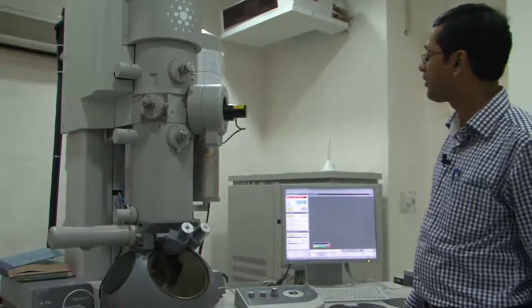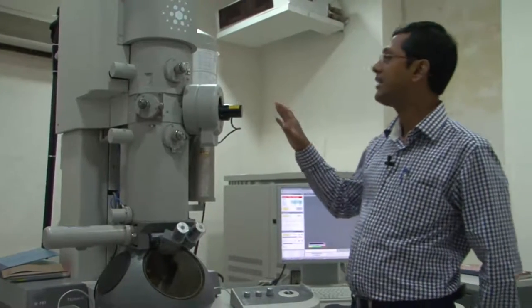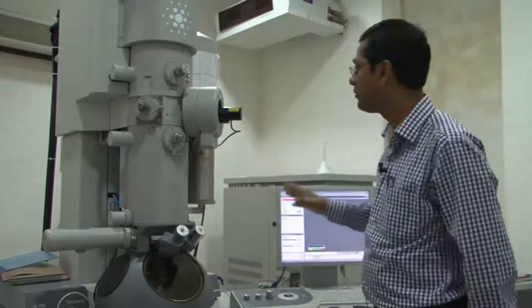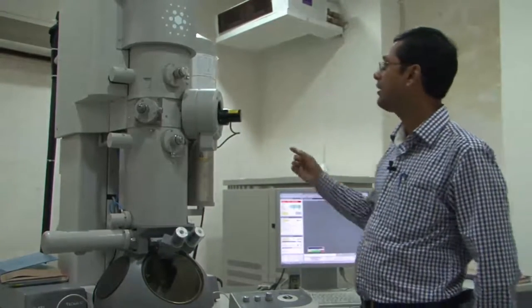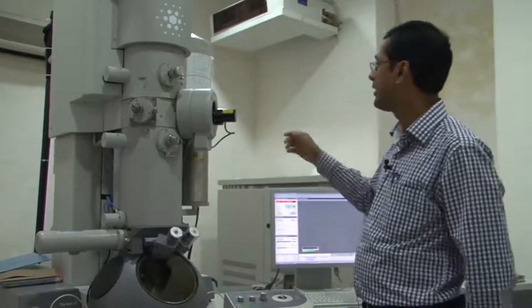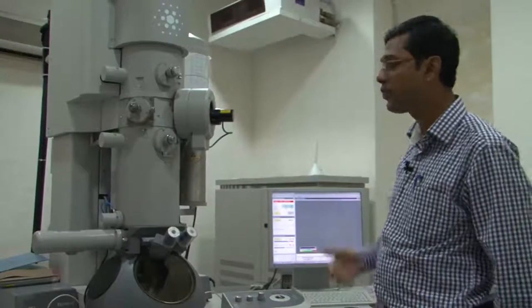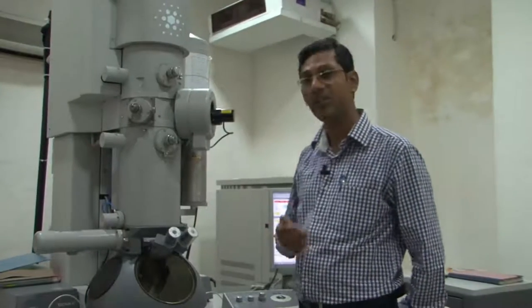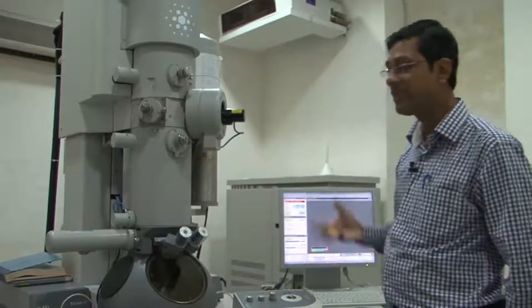Other than that, this microscope has basically to make the vacuum system clean, we need to have a liquid nitrogen cooled setup, where there is a liquid nitrogen chamber which can take care of all the contamination on the sample, because most of the samples will have contamination, not only when the electron beam falls on a sample, it can generate contamination.